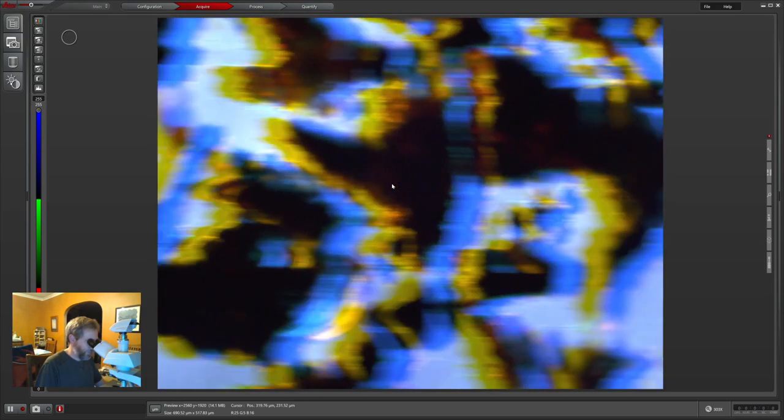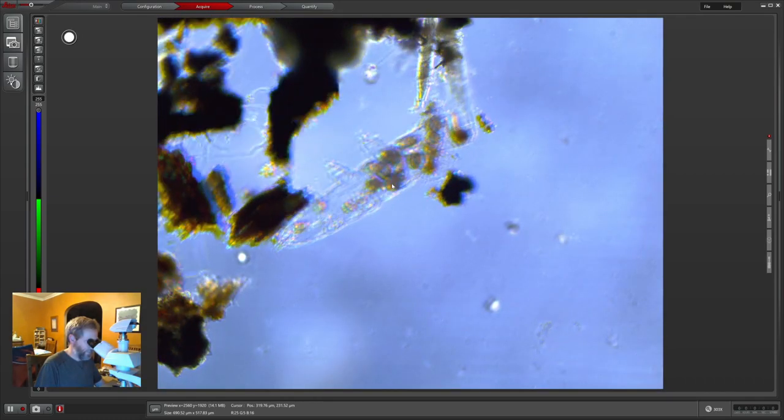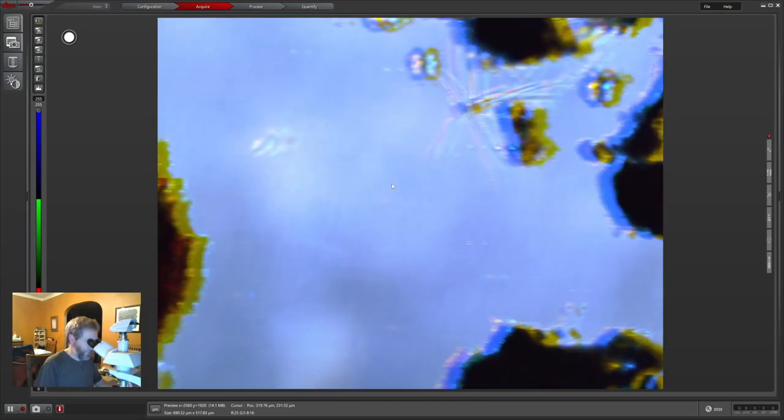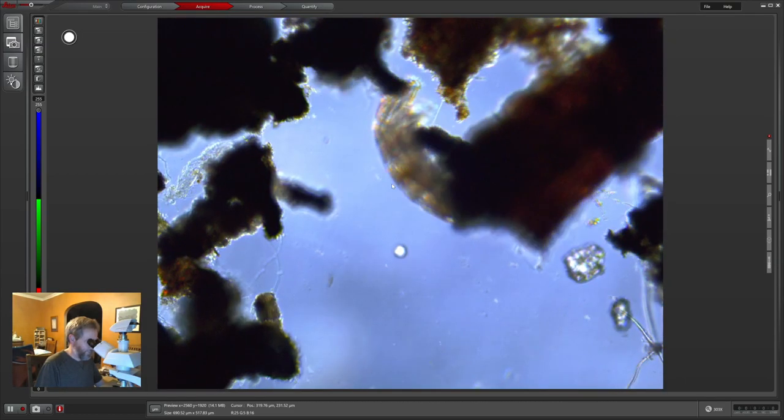The nematodes are crawling around in here, and here's the little eggs — we're not very far away now. They're creeping in on the egg area. They don't have to move very far, which is great.